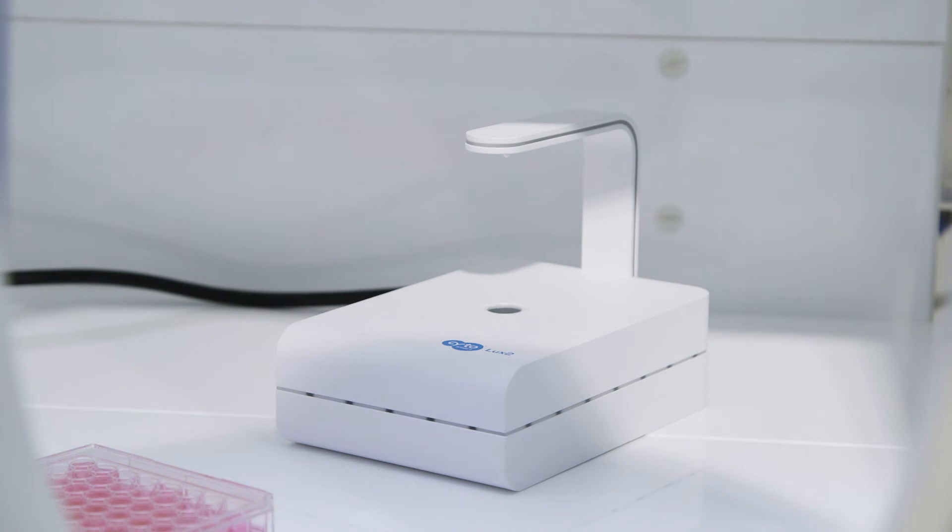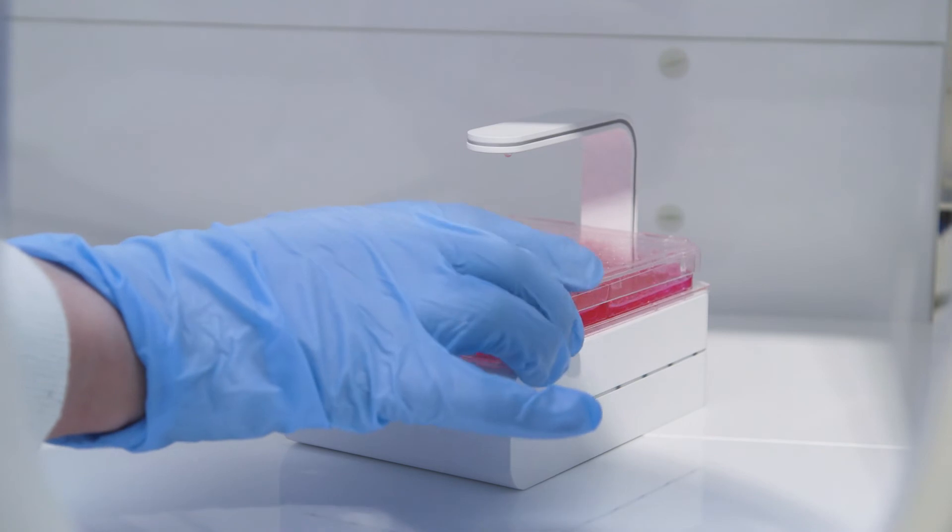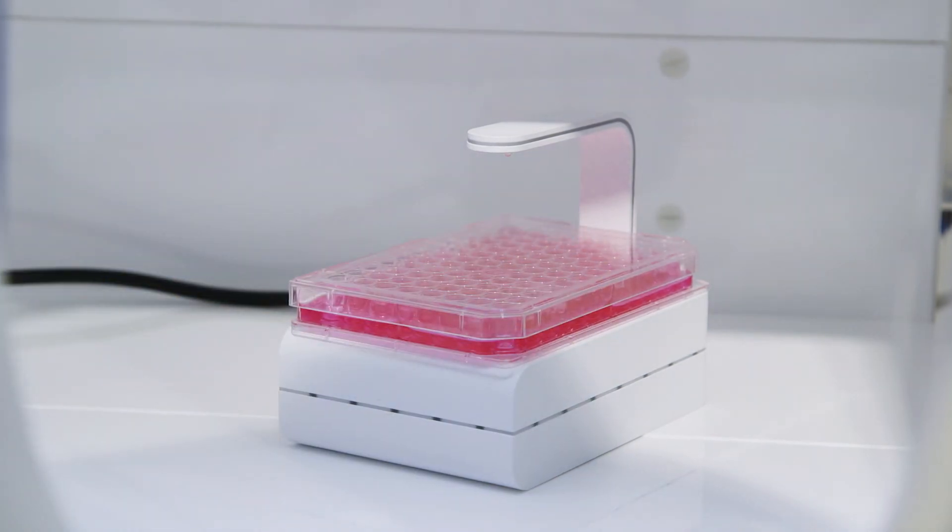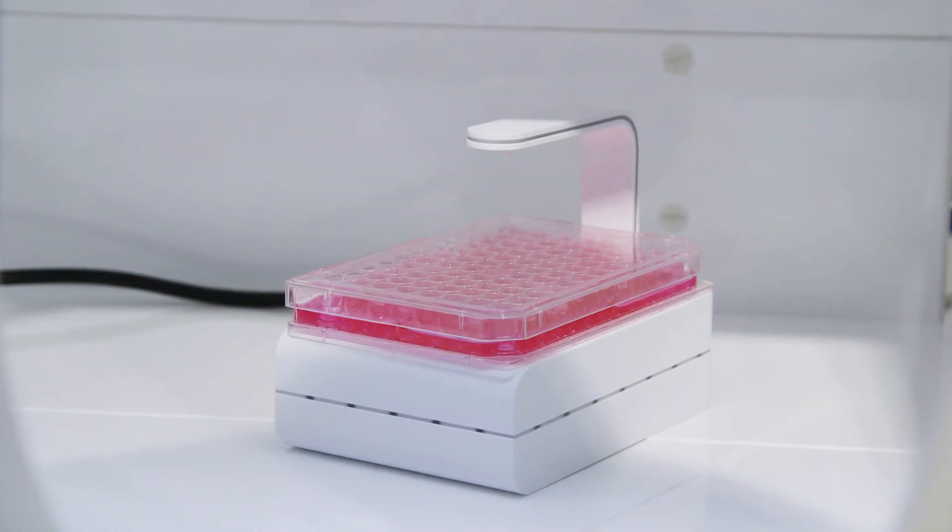Items of equipment can be used inside this workstation, for example compact microscopes. This could be an ideal solution for those wanting to perform live cell imaging in hypoxic conditions.